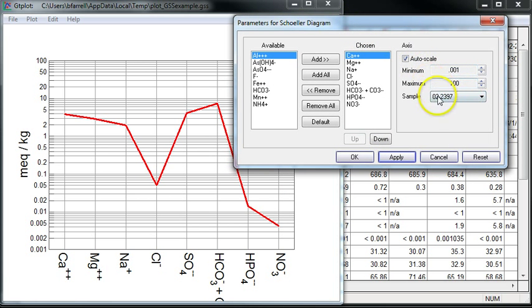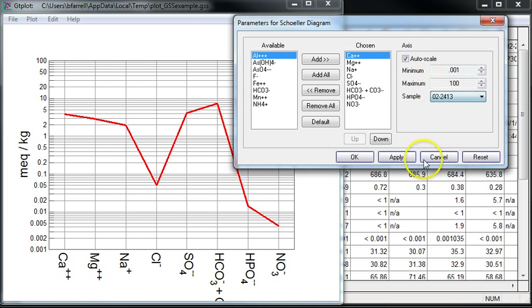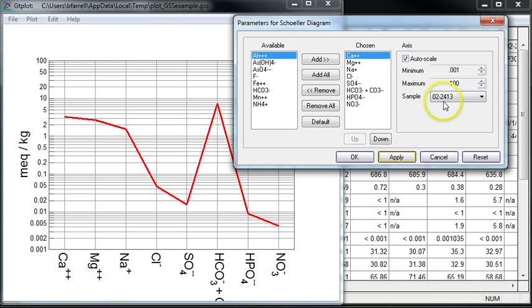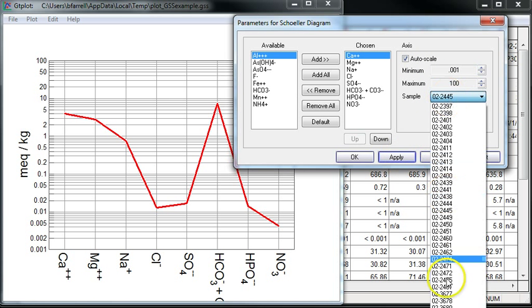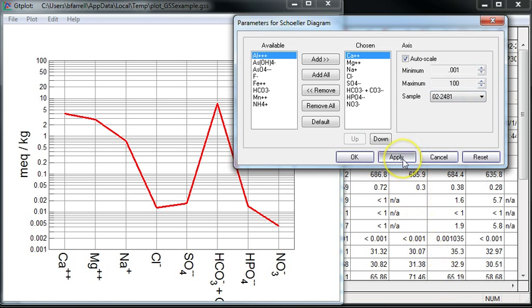I can quickly look at different samples in the drop-down list. Thanks again for watching.